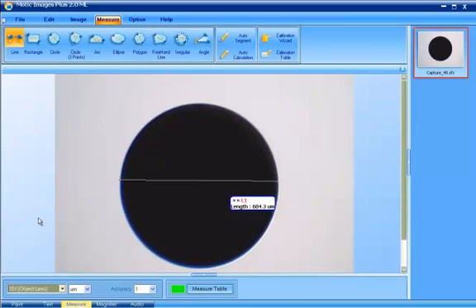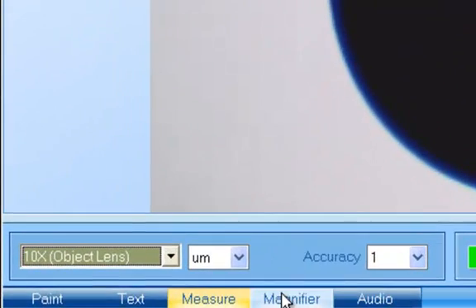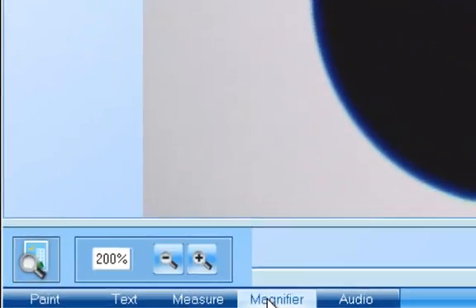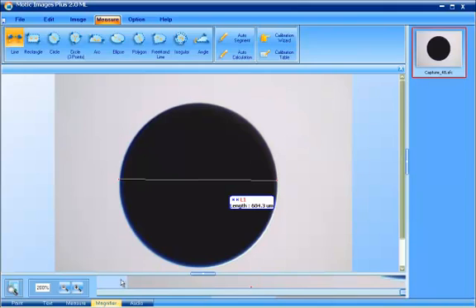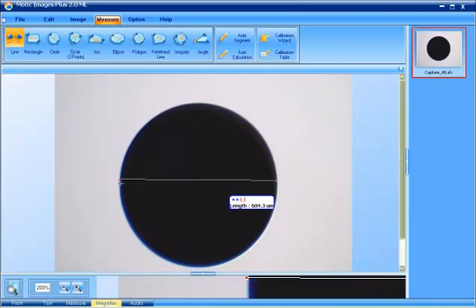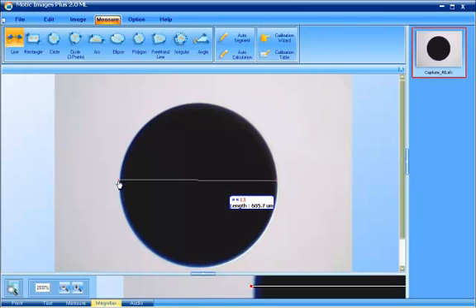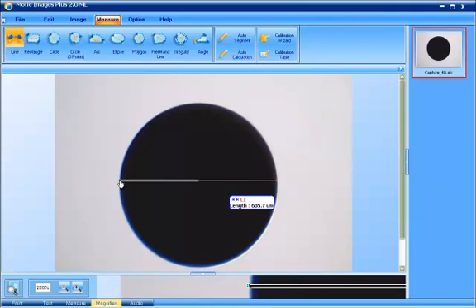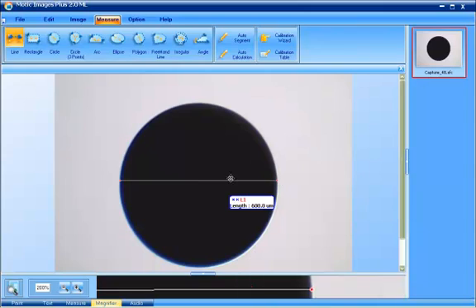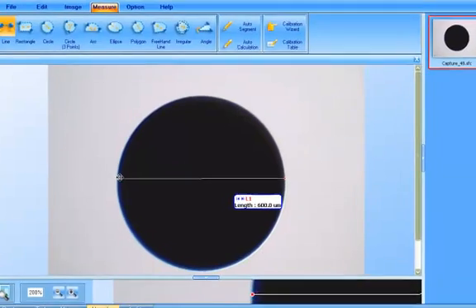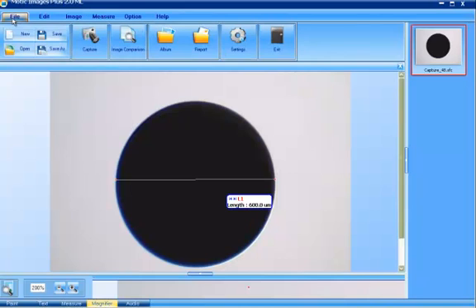Now this is not entirely accurate. We can make it a little bit more accurate by using the magnifier. So you can see at the bottom of the screen, the red dot is where your mouse is. So you can actually position it right on the circle's edge. And the result is now 600 microns, which is exactly correct.